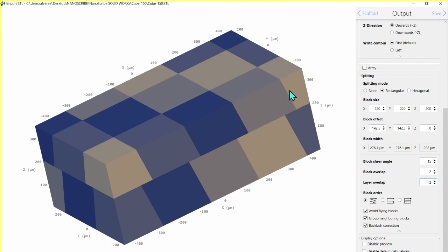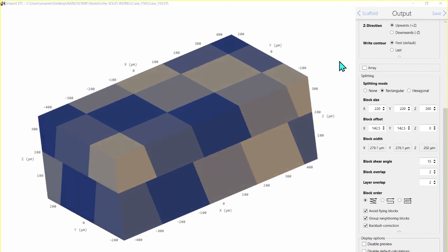But if you have one structure that has something hanging here, and the structure that is here is printed before the branch that makes it together, this other structure will be flying, and you will lose it inside of the photoresist, okay? So please make sure you click on this to prevent any error, okay?